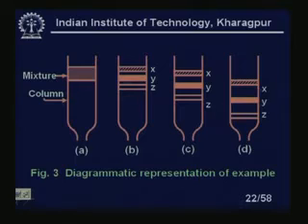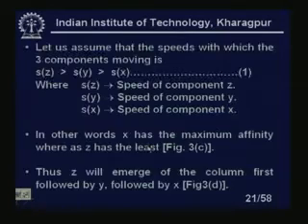Here the three components X, Y, Z are a mixture. As the time goes by, the separation, that means the elution time, becomes more and more. So the gases come out one by one: Z will be detected, then Y will be detected, then X will be detected. So, I can go back.